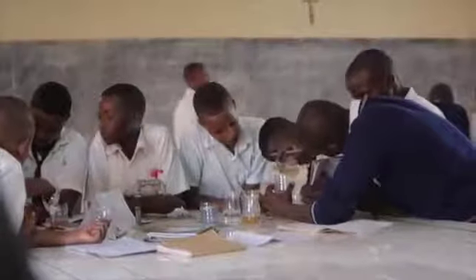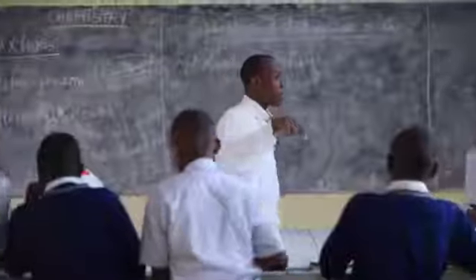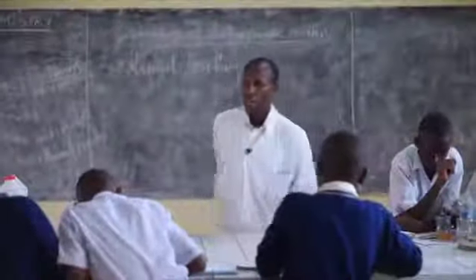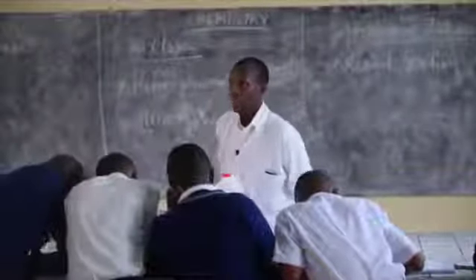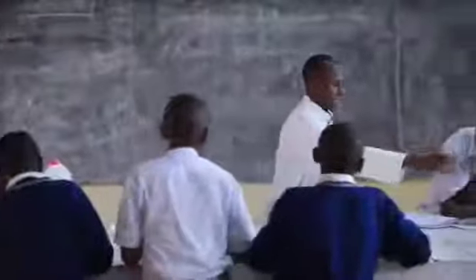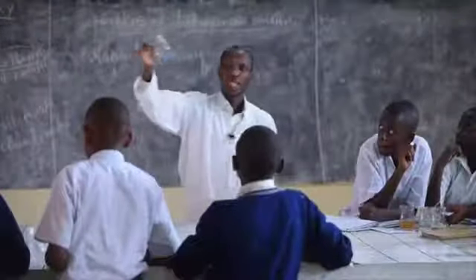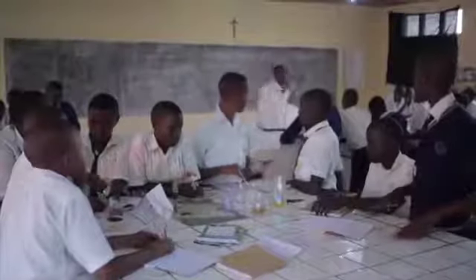Now you are going to write down in your notebooks the method which you are using. That method has a name. Write down the name of the method for separation of oil and water. The other question: this instrument which you are using, in chemistry, has a scientific name.